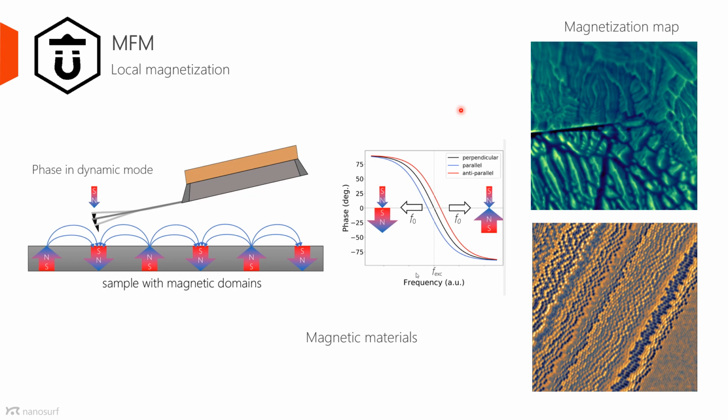For instance, if you think of the tip as one magnet and the sample as another, if you have two strong magnets, you're going to produce a strong signal. But maybe one is going to affect the other and move it or turn it upside down. So maybe you want to reduce the amplitude of one, but then maybe now the signal is too small, so you need to balance.